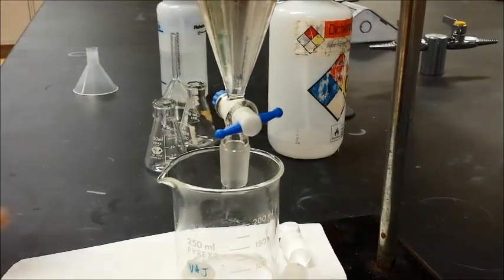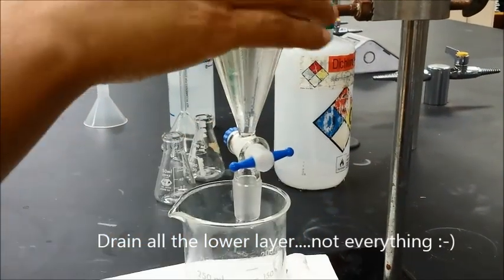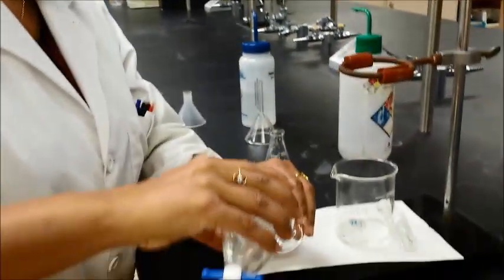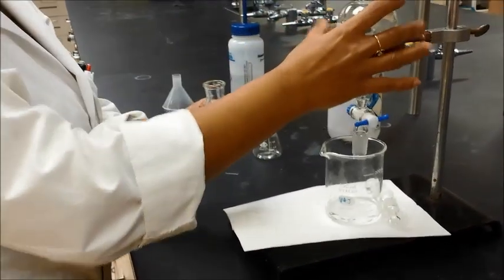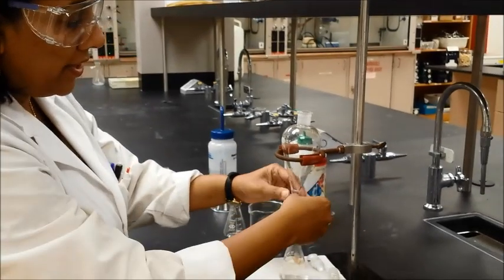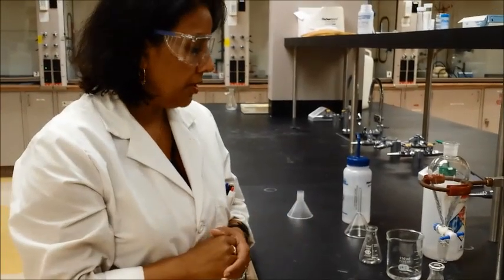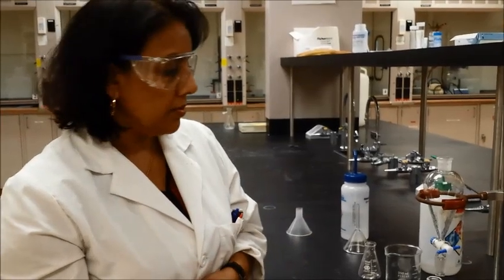If you are collecting the top layer, go ahead and drain everything from the bottom first, then take the separatory funnel and pour the top layer out into your flask. You don't have to drain it out from the stopcock, although you could if you wanted to. Either of those two approaches will work. This is how the separatory funnel works. If you need to do another extraction, pour everything back in and use the same process. Depending on what your waste is, please dispose of it in the proper waste containers.